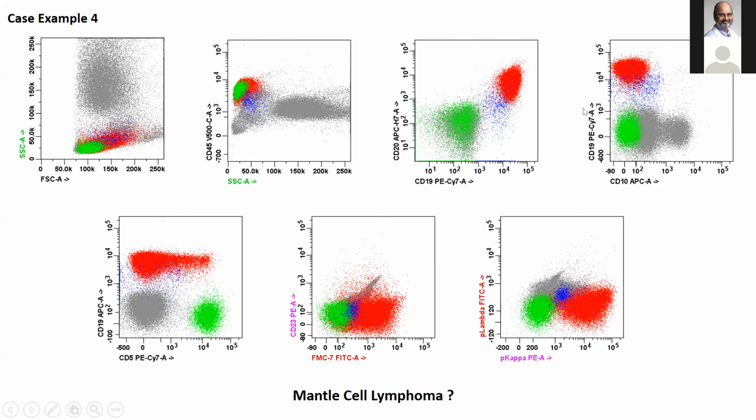The blue cell population is kind of interesting because it's definitely B lineage. And here, if this is my diagonal going up, I can't tell necessarily whether this is shifted for real or it's along the diagonal. My suspicion is that it's truly shifted, and this is dim expression of kappa. So I think I've got two monotypic populations of B cells here showing two slightly different immunophenotypic features.